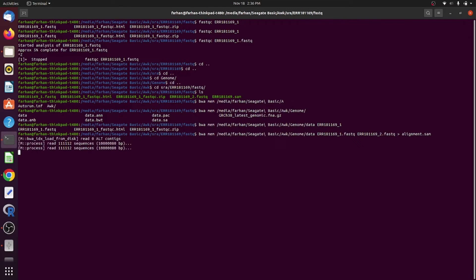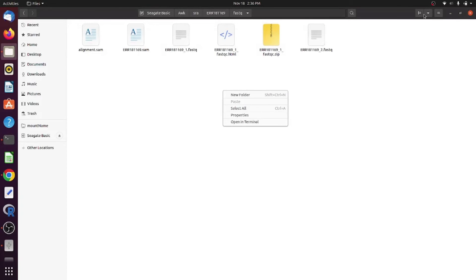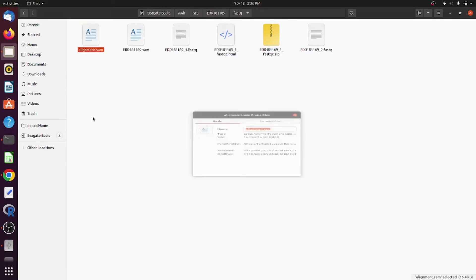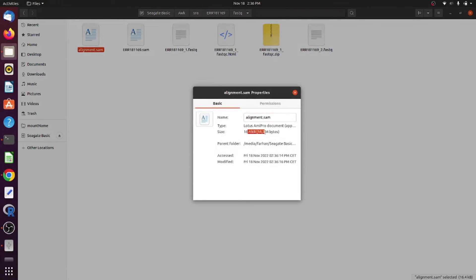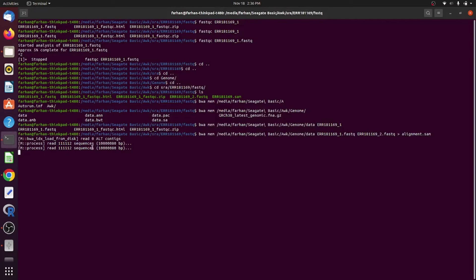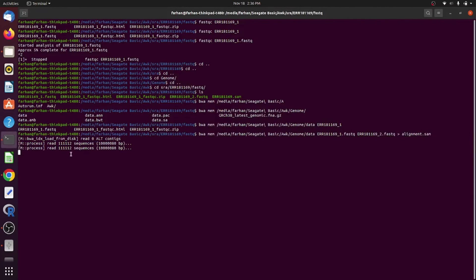Fast mapping has started, but it will take quite a while. As you can see here, the output file size will keep on increasing. When it's done, it will automatically stop and store your file into the selected folder.